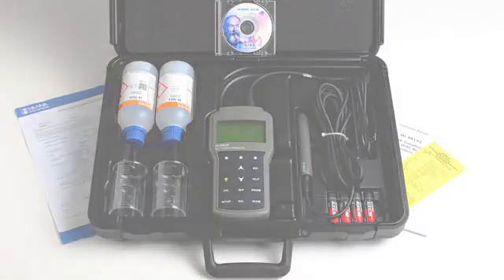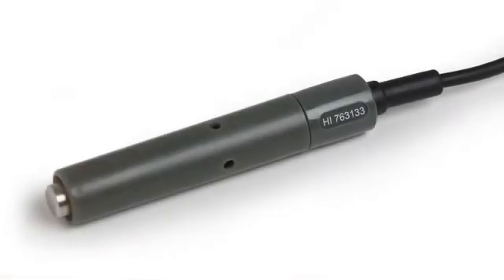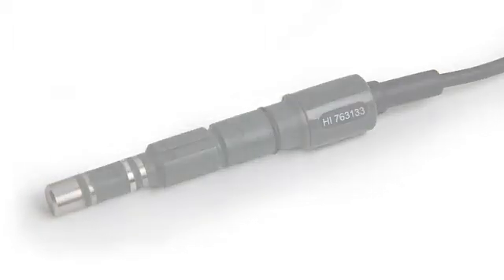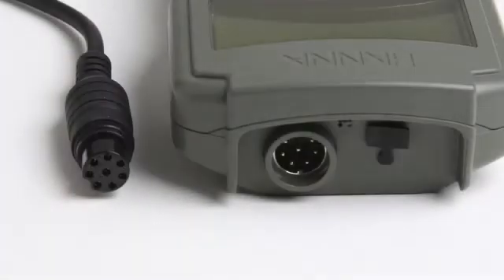The meter also comes with the HI-763133 four-ring probe with integrated temperature sensor. The probe connects to the meter through a single cable with a waterproof quick connect DIN connector.